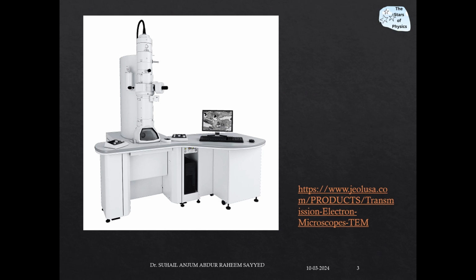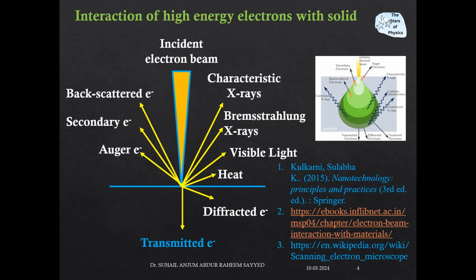Now this is the image of an actual TEM, which I had taken from this website. So this shows the actual TEM. The whole system is in vacuum, and then only we can observe the images here, which is very similar to the case of SEM also.